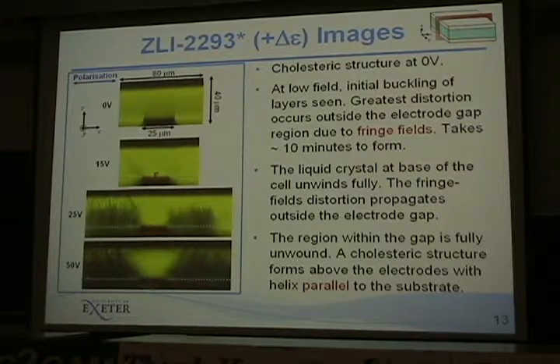So these images are taken up to about 20-25 minutes. And you can still see defects zipping through the cell parallel to the electrodes during that time. So this is where it's slightly smeared out, because it takes 3 or 4 minutes to get a full 3D image from this scanning technique, so it varies slightly as we've started the scan.